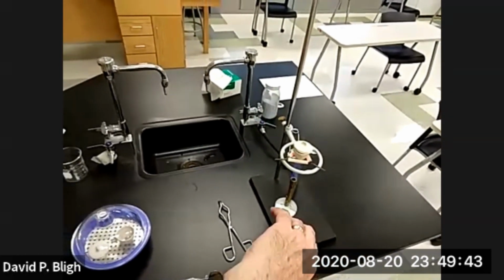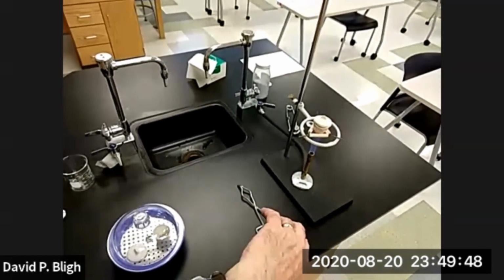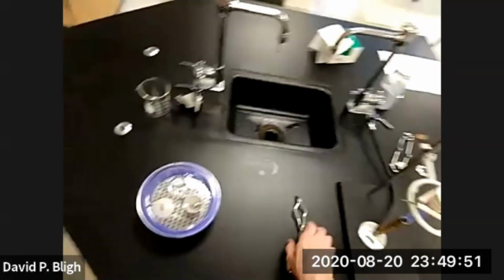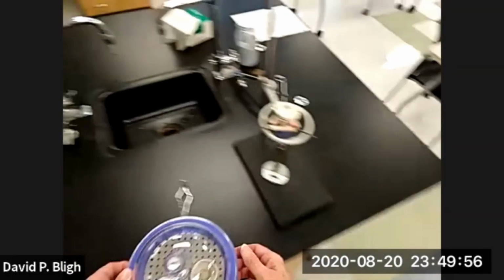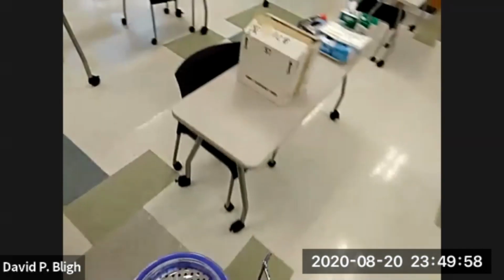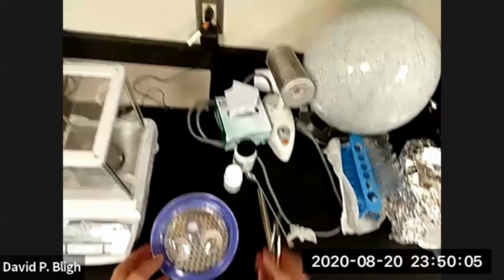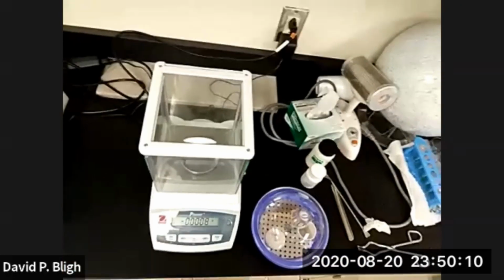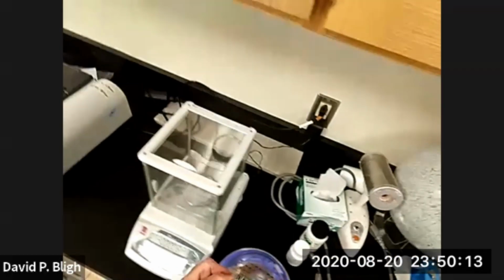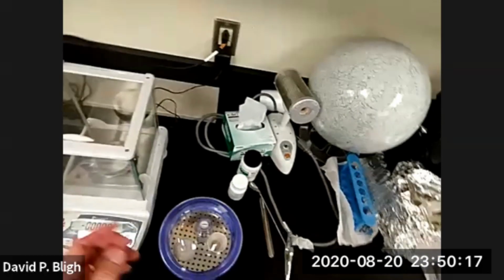So we're coming up on 10 minutes, or is that 5? That's 5 minutes. So we're going to heat that some more, and let's see how our second crucible is doing with weight. And notice when I say weight, I really mean mass. It's a holdover from the good old days when we weighed things rather than massed them. Mass was never used as a verb, whereas it is now.